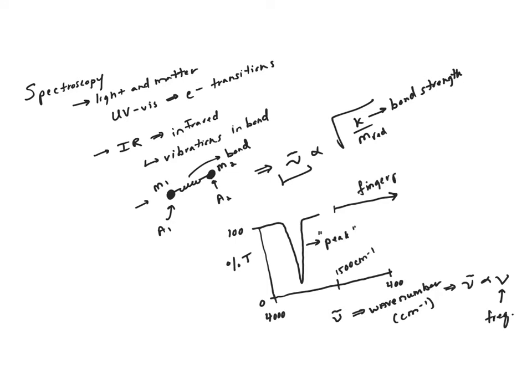Is there anything really useful for us in the spectrum in the fingerprint region? No, right? So these are going to be all single bonds. It's really going to be icky, really going to be gross. There's going to be a lot of different signals, so we're not going to be able to utilize anything down there. What was everything to the left, from 1,500 and above all the way to 4,000? Diagnostic. Right, so this was the diagnostic region.